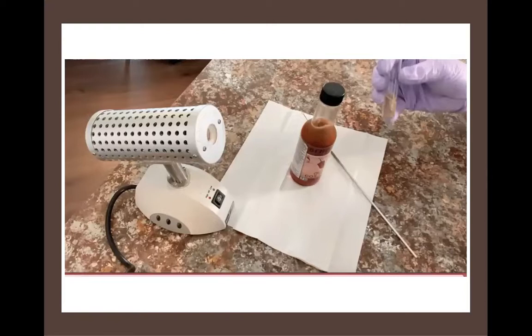People don't always flame glass test tubes. Sometimes it's just too time-consuming of a procedure, but I want to show it to you because it is, again, an extra layer of protection against accidental contamination. You would never do this with a plastic test tube, though, of course, because you would melt the plastic.